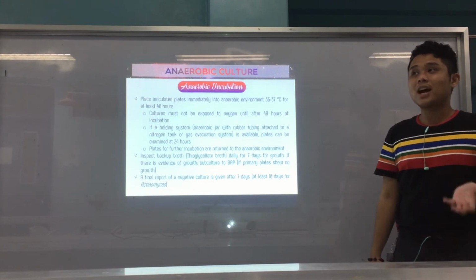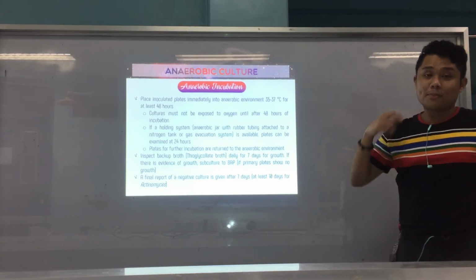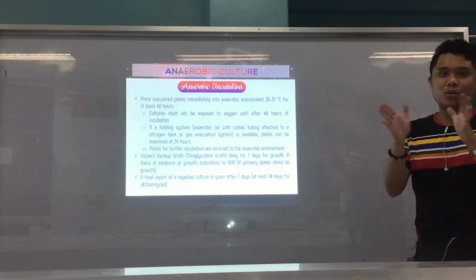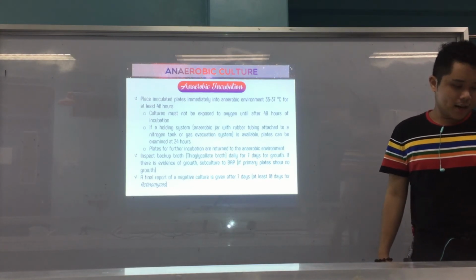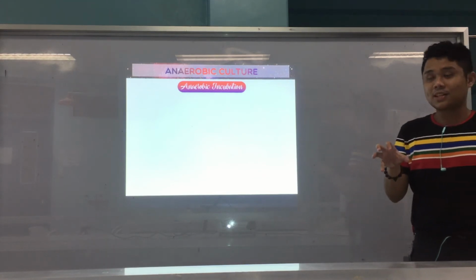So actinomyces is a branching filamentous, mura siyang nocardia, alright? Mo branch, mura siyang fungus-like bacteria, actinomyces. Okay. Alright. Okay, now we go to different incubation systems na pwede magamit.